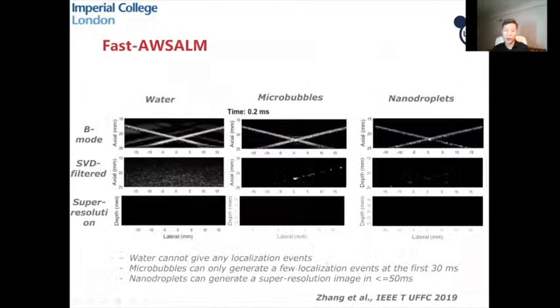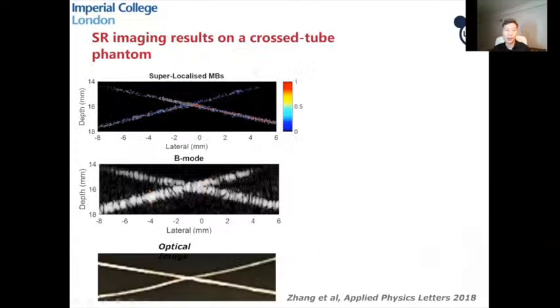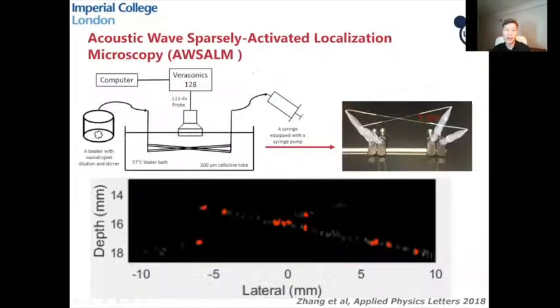More recently, we have developed this technique, which we call acoustic wave sparsely activated localization microscopy, also known as AWESOME.